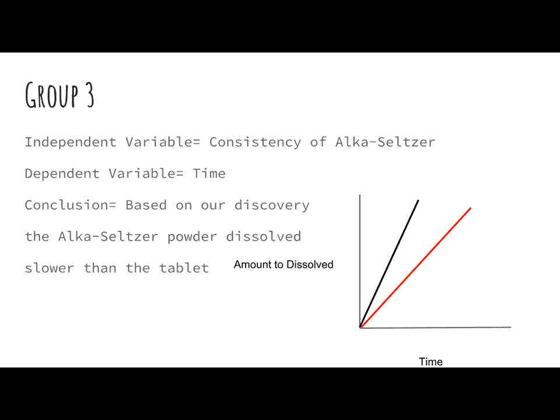So if we had modified our procedure by putting the powder and the tablet in the beakers first, and then pouring the water on top, what do you anticipate we would see? Because you know that this contradicts what we should have seen. Right? Everybody should understand we should not see this, but this is just the nature of how powder doesn't go through the surface very well. That's strict surface tension of water. So assuming we modify the procedure, what would we have seen instead?